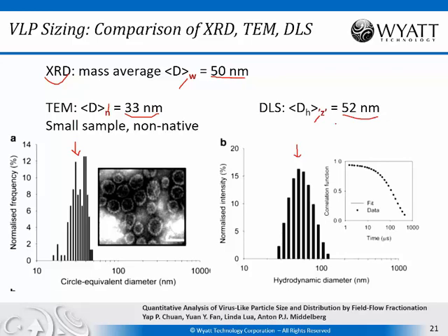Now this is not extremely rigorous. It's not rigorously a Z average diameter, but it's reasonably close to a Z average diameter. We won't go into the mathematical details, but that's approximately what we get. And we can see that it's about the same. What that tells you is that at the high end of the distribution, the weight average and Z average are about the same. Z average doesn't really see these smaller particles down here, which don't scatter a lot of light.